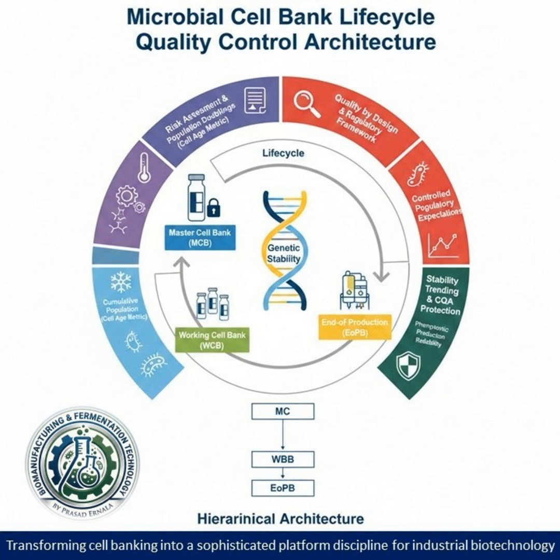And with yeasts, we often see glycerol used instead of DMSO. Why is that? That's often a regulatory constraint. DMSO is highly effective but comes with toxicity concerns. Yeasts tolerate high glycerol levels very well. And for food or nutraceuticals, avoiding any residual solvent is a huge plus.